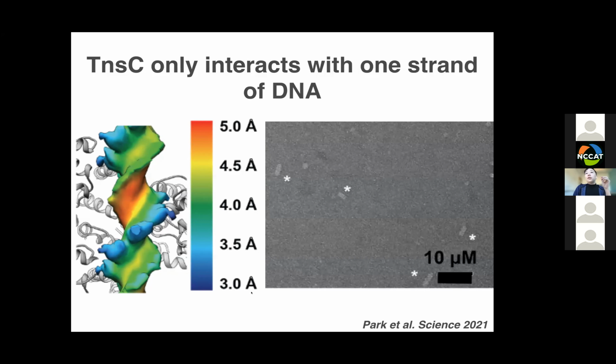We did a negative stain imaging session where we took single-stranded DNA and added this protein and ATP. You can see that it's not as robustly forming polymers, but it can form these filaments on single-stranded DNA as well. So in this way, paying careful attention to the features of your map allows you to formulate hypotheses about your biological systems that you can then test.